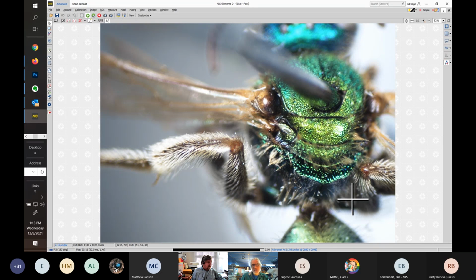Mike, do you have anything else to add on top of that? No, but another interesting thing about the specimen, at least what I'm seeing right now on the screen, is that it's one extreme of the propodeal characters.